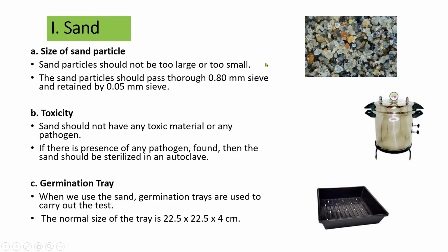So the sand that we are going to use as substratum is going to go through sieves of different pore sizes.